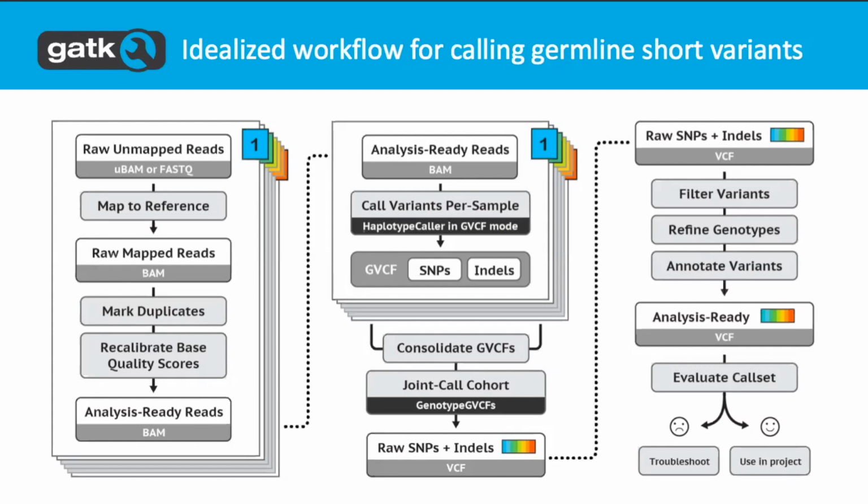Tomorrow we're doing this tutorial on germline filtering, where we will use CNN to filter variants. We'll have this workspace set up where you can test different settings of CNN, tried multiple times on different data sets. I think the question is, if you run it on the exact same data set, does it spit out the exact same result every time? So is it deterministic? I believe it should be.